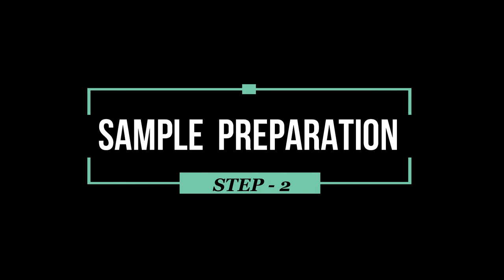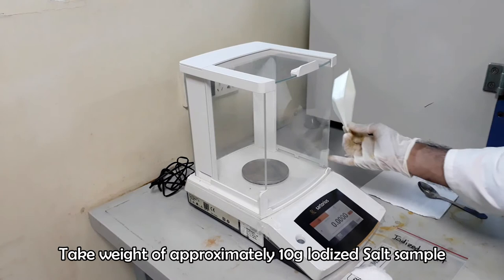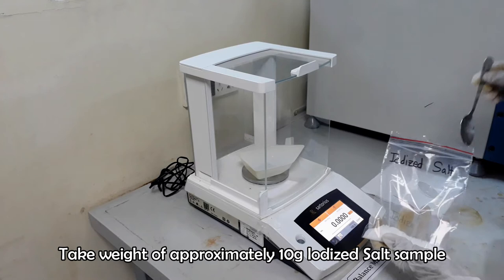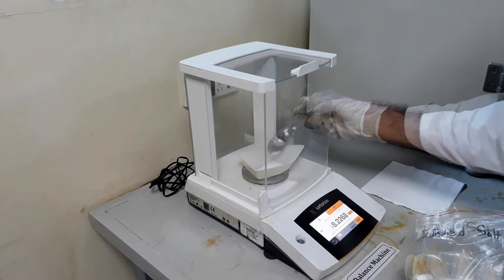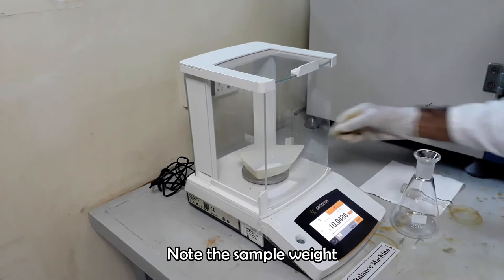Now we will prepare our sample. Take weight of about 10 g of iodized salt sample. Note the sample weight. Transfer the sample in a conical flask.